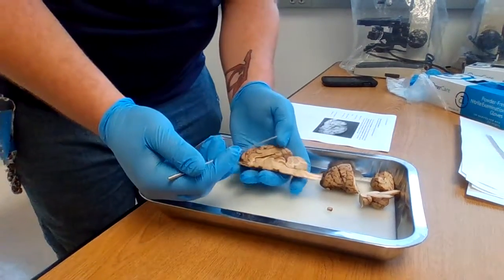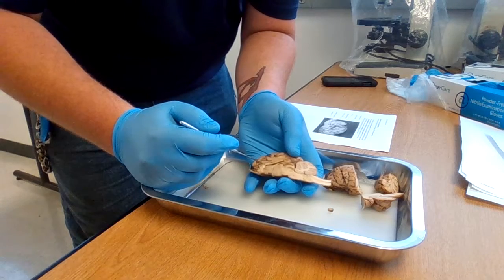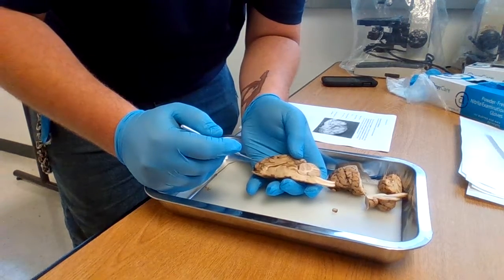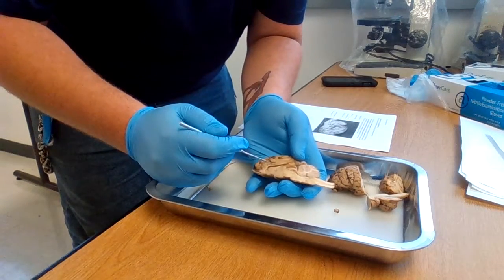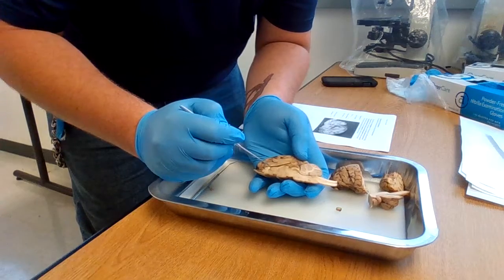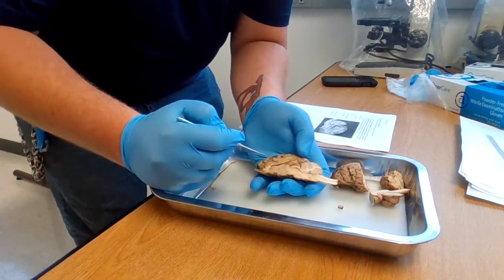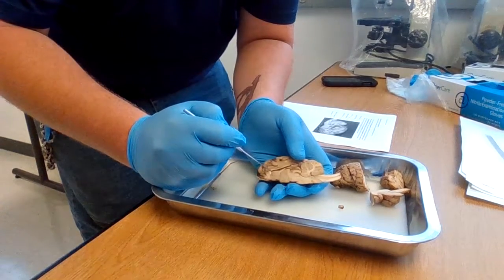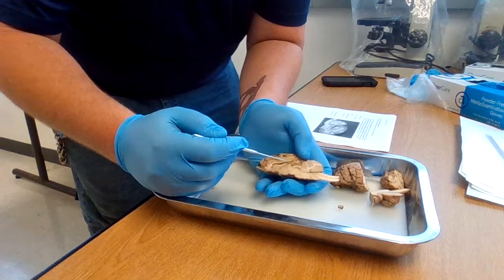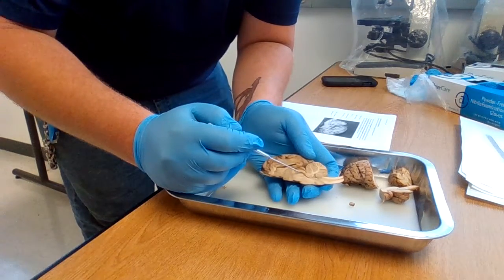Once we have dissected it, you can see the cingulate gyrus, the lateral ventricle, the fornix, the septum pellucidum, then the third ventricle, as well as the cerebral aqueduct, which is going to be right here, as well as the tegmentum.